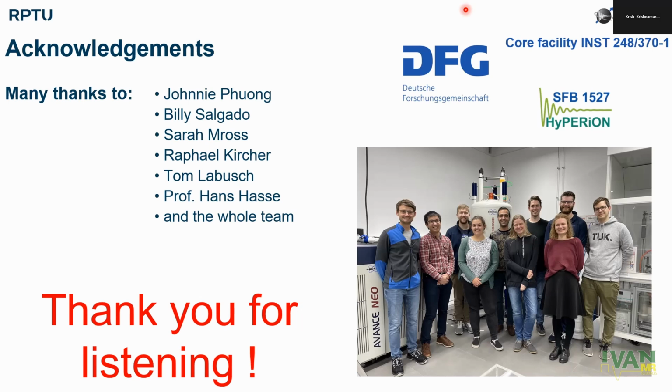Kozminski published something about 6-7 years ago on time-resolved, non-uniformly sampled methodology to monitor reactions at an increment-to-increment level.